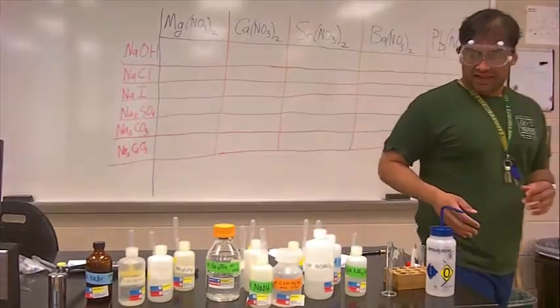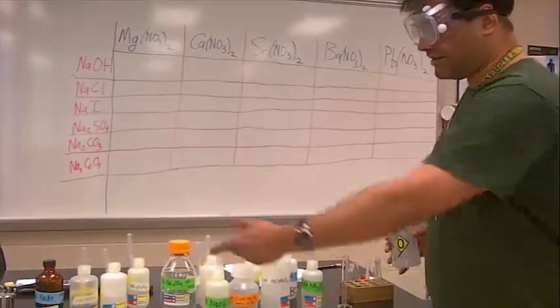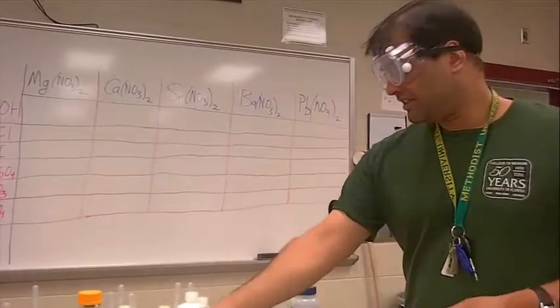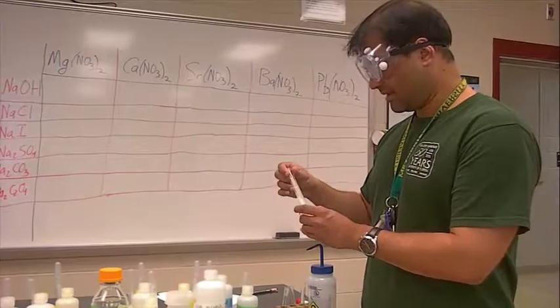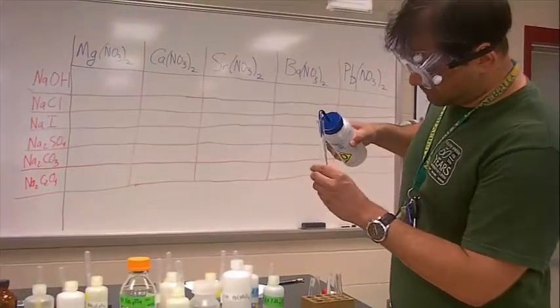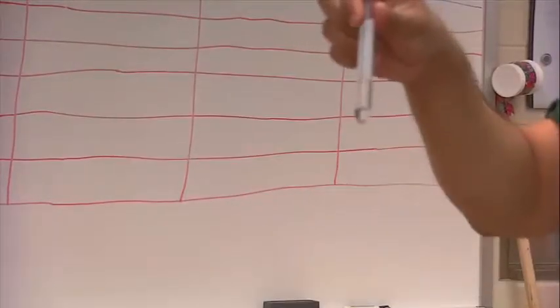So just as a previous lab that you've done before, you're going to react each of these bottles with each other. All of these are aqueous solutions. So as before, we will take about 1 ml of water to determine our 1 ml mark. So that's about 1 ml. Set your 1 ml mark. So I like to use a Sharpie, so that's 1 ml.